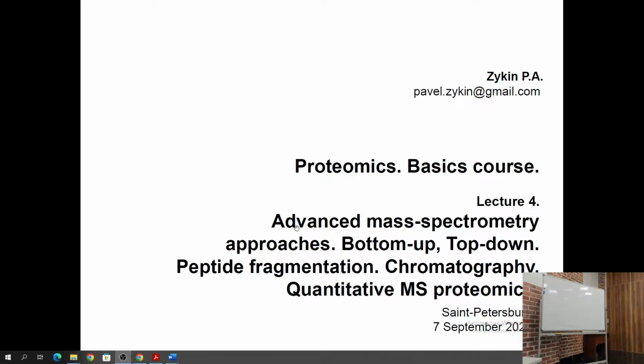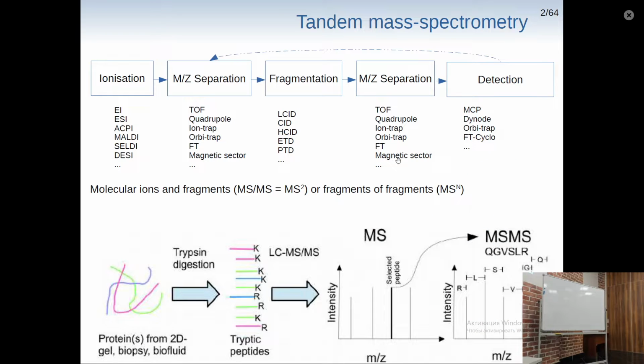So, to start, we have to explain so-called tandem mass spectrometry. We've already touched on this topic yesterday when we were discussing applications of quadrupole mass spectrometry.